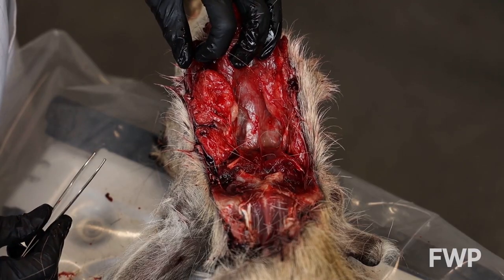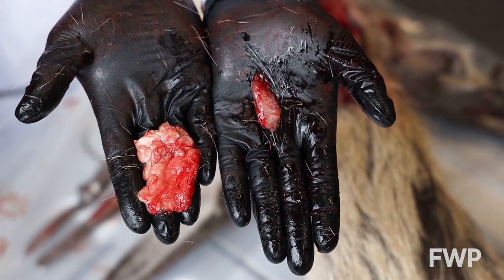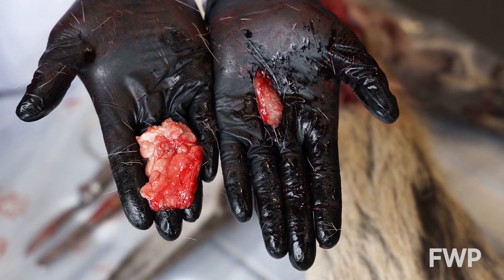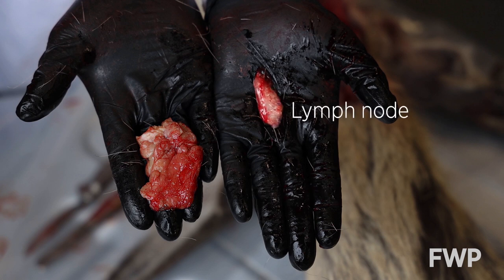The other lymph node will be in a similar location opposite the first. Here is a side-by-side comparison of a salivary gland and a lymph node. Salivary glands are often mistaken for lymph nodes, but they are usually a lighter color, larger in size, and have a soft, uneven texture. The lymph nodes tend to be smaller, darker, and firmer than the salivary glands, oval shaped, and have a smooth texture.